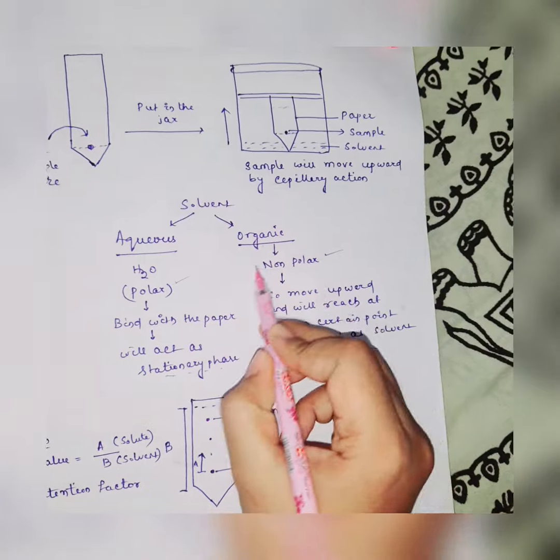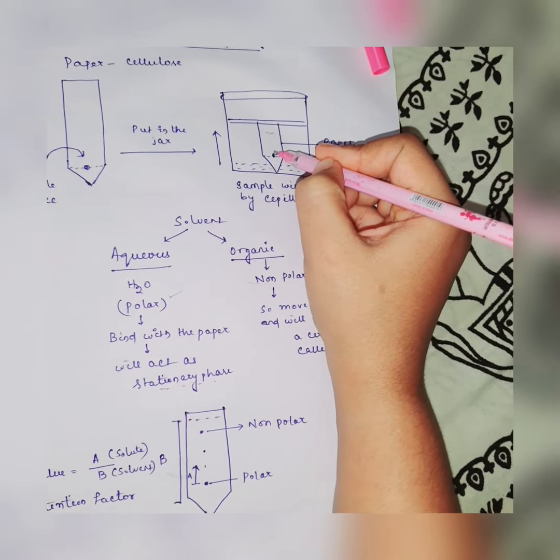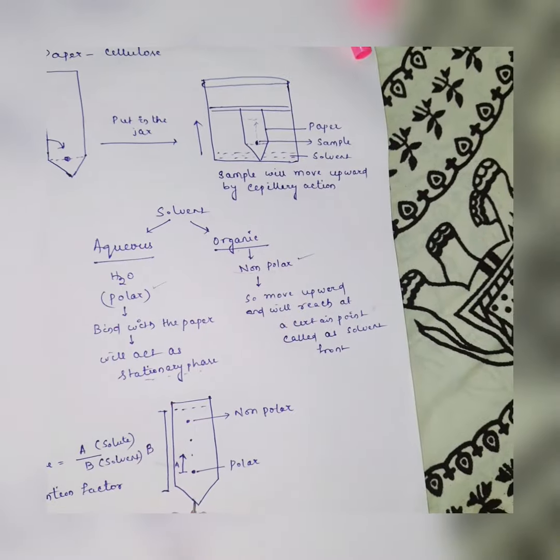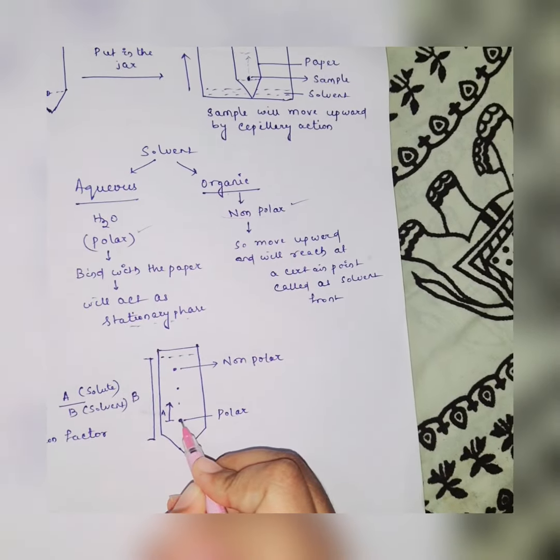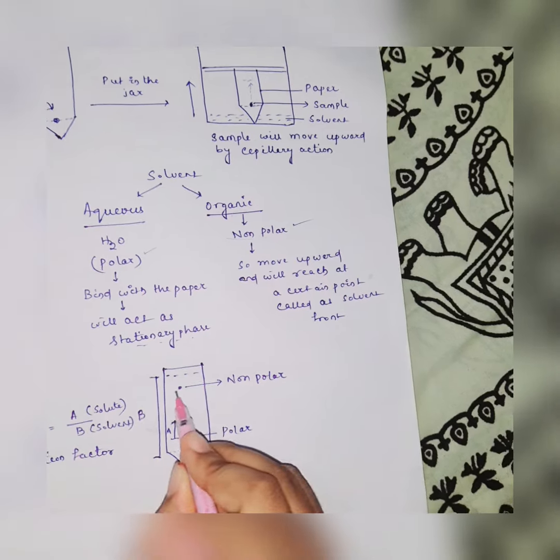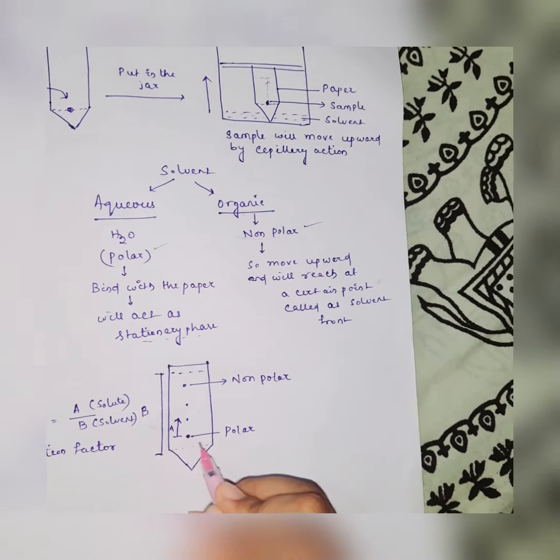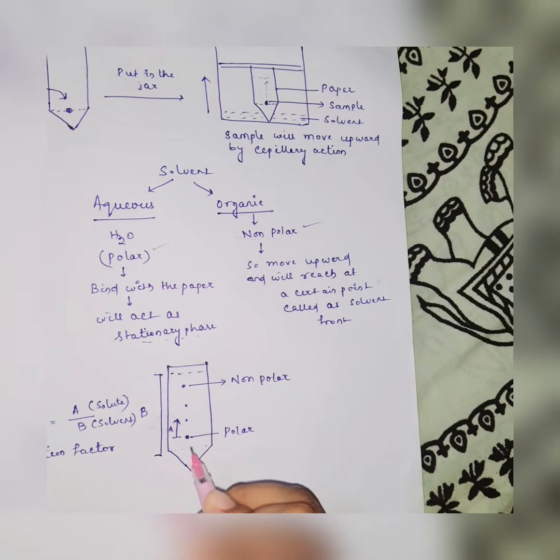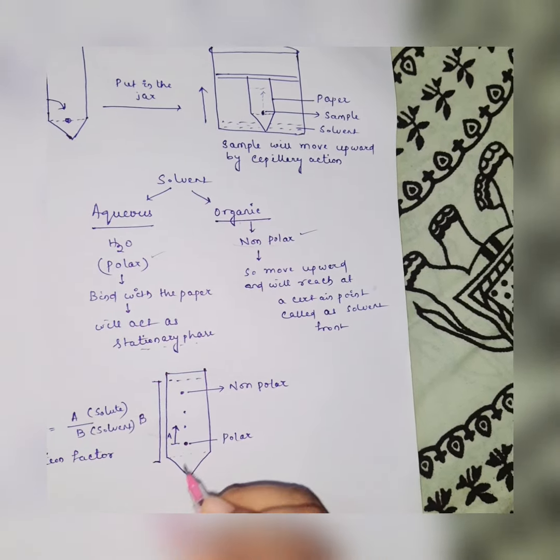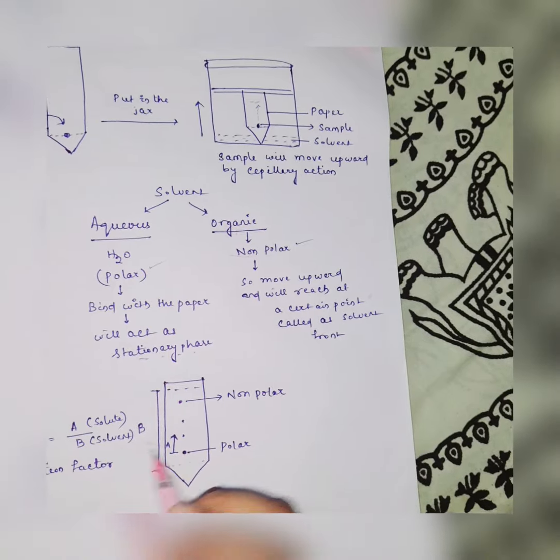This non-polar solvent, by taking this sample, will move upward, and some components are polar and some components are non-polar. More polar components will move slower, whereas non-polar components will move faster.